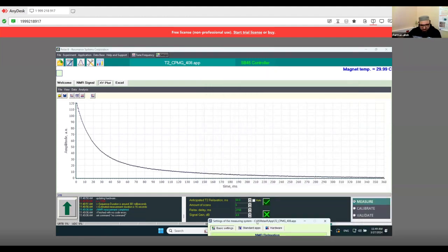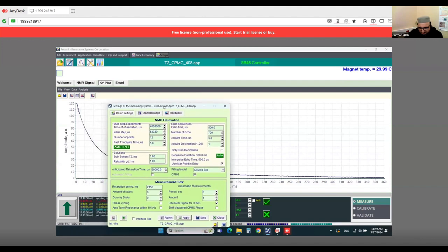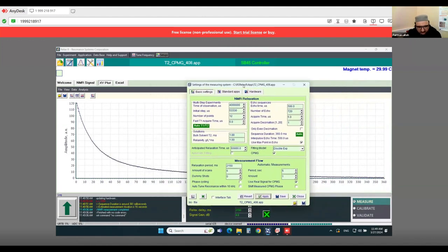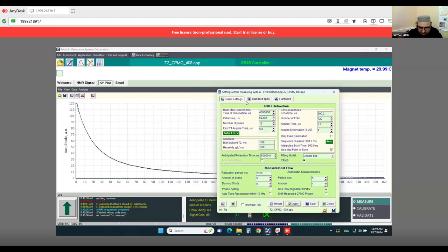Okay, so this is a result which seems extremely good. So I will proceed with this result.